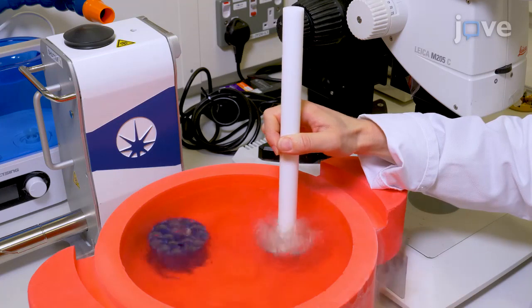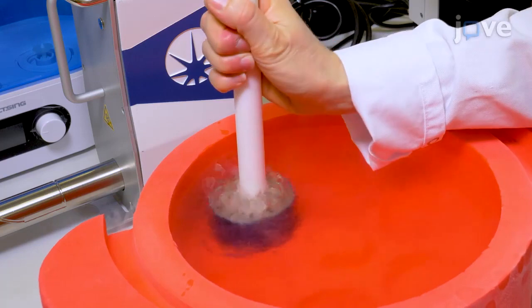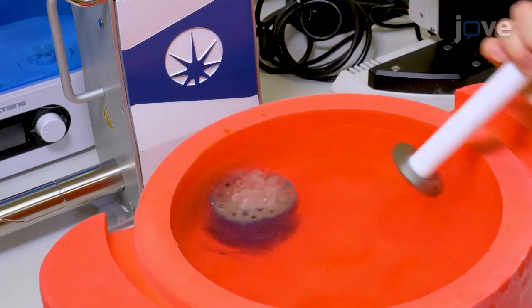To close the puck, use a puck wand to attach the base to the lid. Transfer the combi puck from liquid nitrogen to the dry shipper or storage.